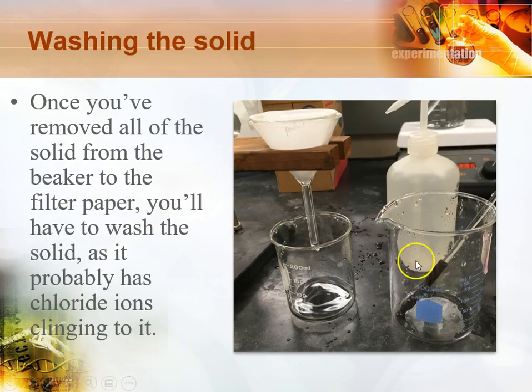If you look over here, you can see my rubber policeman, and you can see the beaker, and hopefully you don't see any traces of white solid over there. So now my white solid is in my funnel.